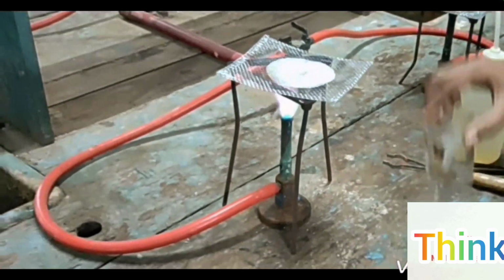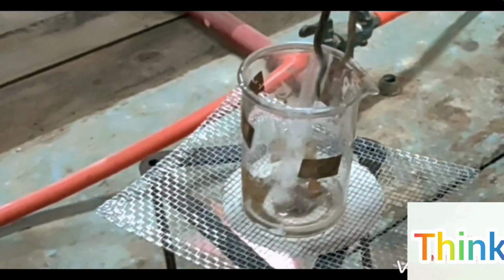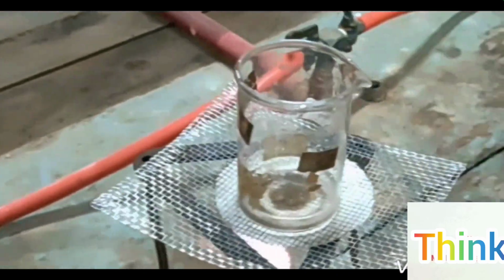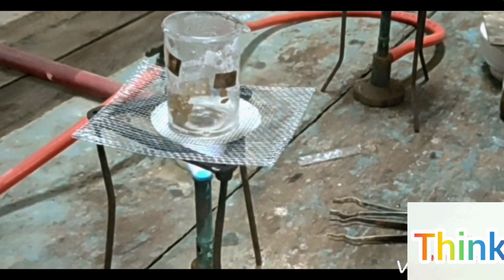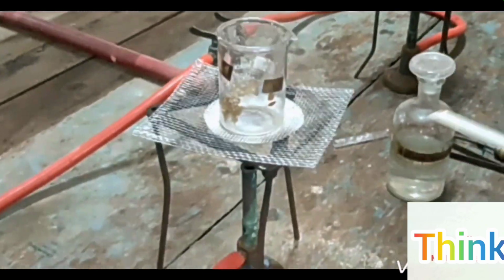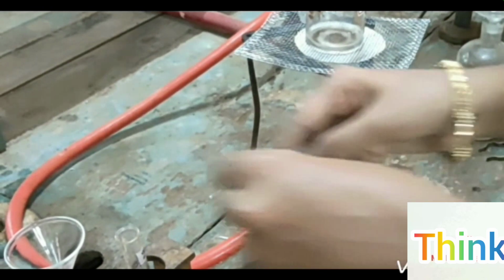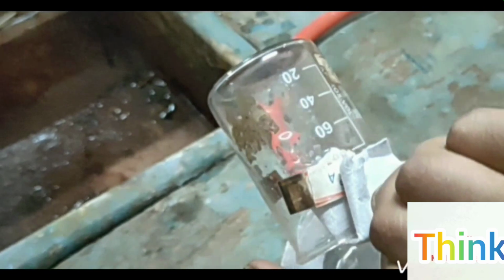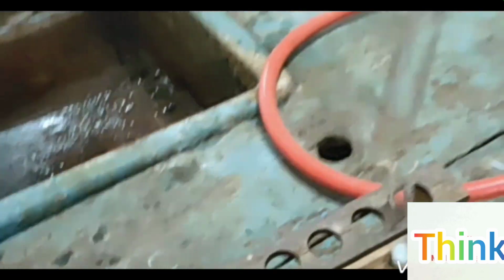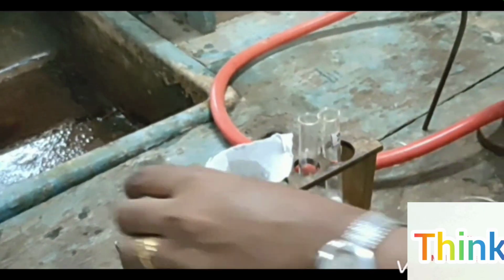After the reaction is complete, you can see a red hot tube, and then we plunge it into 10 ml of distilled water in a 100 ml beaker, and then we have to boil it. After boiling ceases, we can filter it. So then the next reaction will be addition of ferrous sulfate. Okay. Now the solution cools, and then we can filter it. This filtrate is called Lassaigne extract or sodium extract.